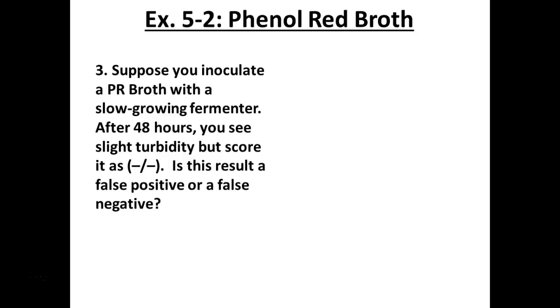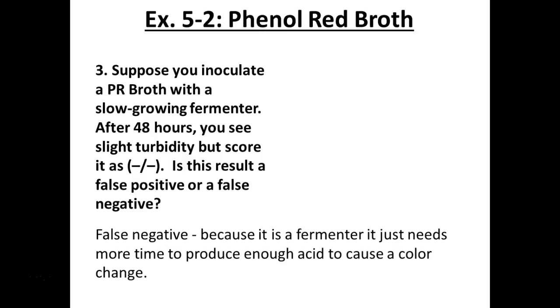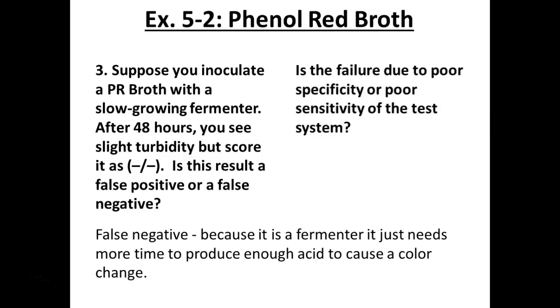You got to give it time. 48 hours is enough, right? So this would be a false positive or false negative. It's a false negative, right? Because I already told you he's a fermenter, right? Eventually it's hopefully going to at least turn yellow. Whether we get gas or not is an issue. Can happen or not happen.